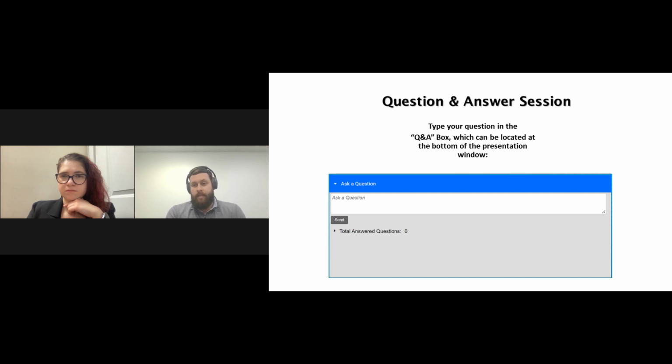I don't have a date for anyone yet, but currently the only configurable solution is 2 analytical lines with 2 detectors. Now, if we have some detectors in series, then potentially we can increase that. But for 3 separate lines or 3 separate detectors, we would only be able to control 2 at a time.